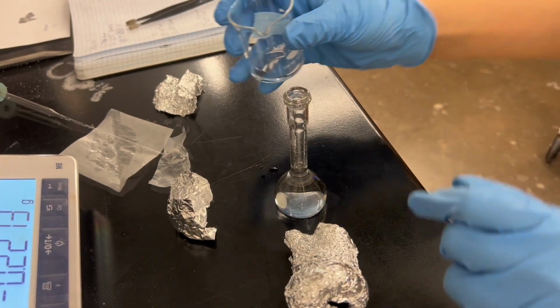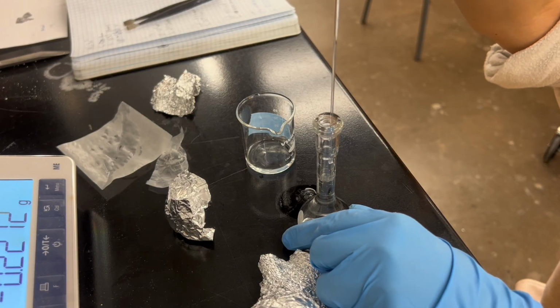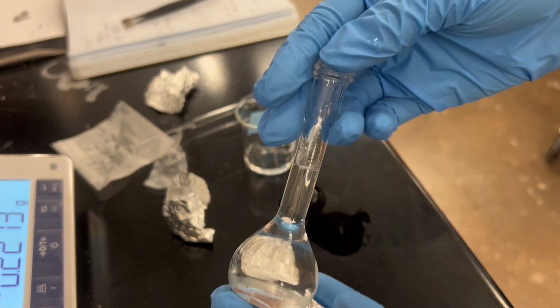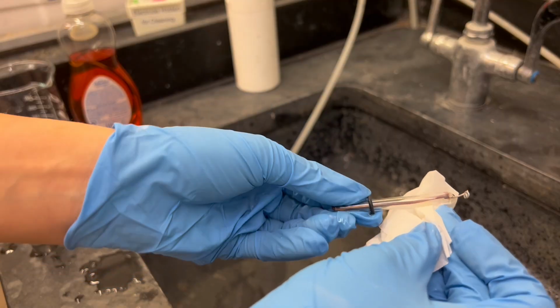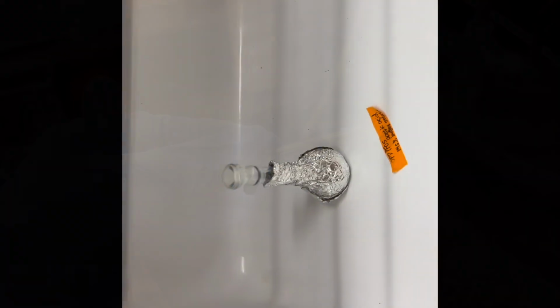Then fill it up to the line. Then take it for sonication. Let's make sure it is not bubbling and is fully dissolved. After this step, we put it into the fridge, back into the lab, and do the counter and reference electrode preparation.